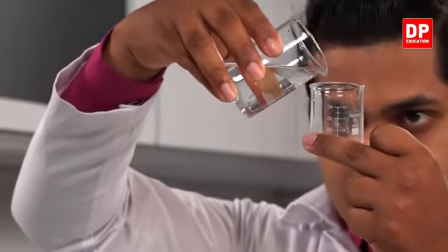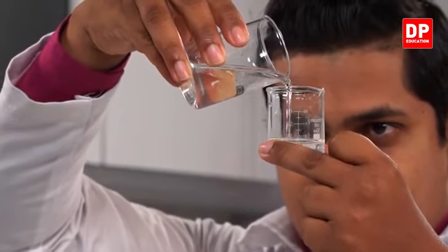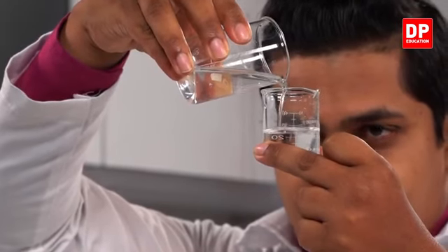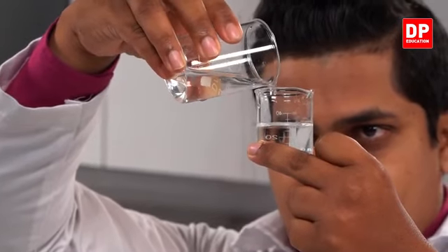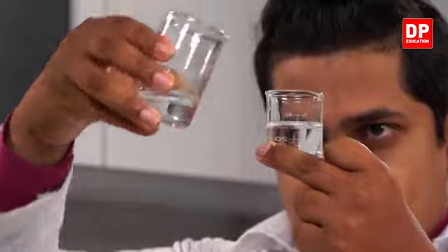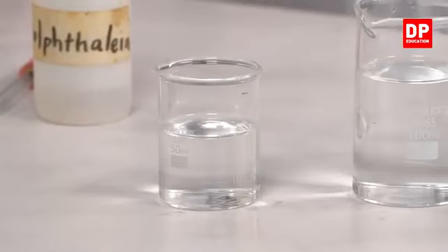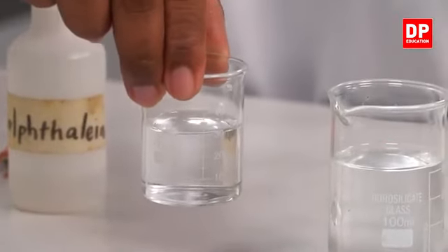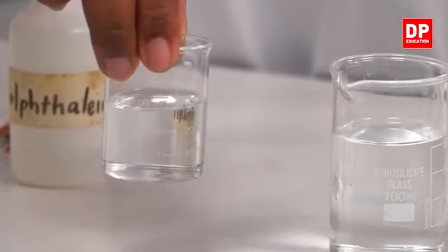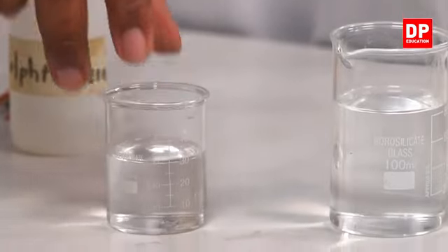We need to keep the beaker at eye level when measuring liquids. 30 milliliters to be exact. So I have measured 30 milliliters of sodium hydroxide solution.